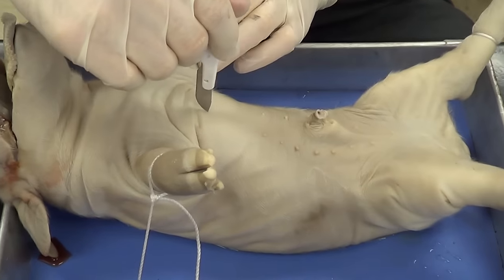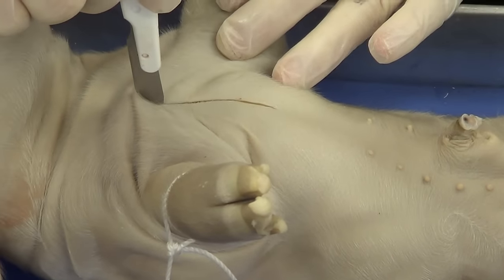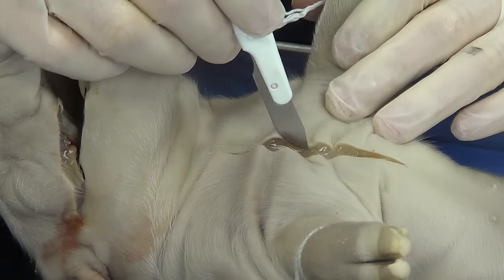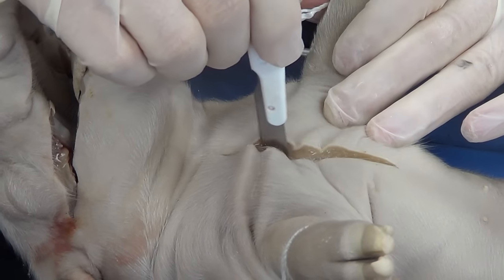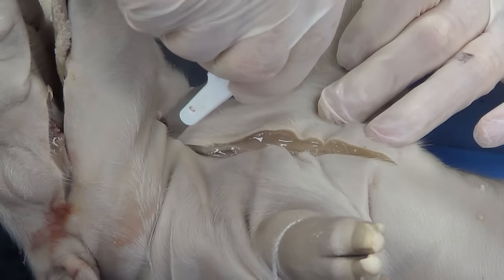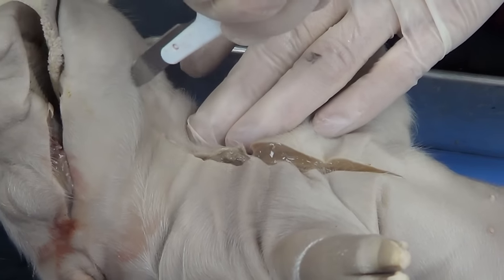I'm going to start right here, put the scalpel in and begin making a cut. I cut a little shallow there — that's okay. I'm into the muscle a little bit. I'm going to cut through that and cut right up into the chin of the pig.